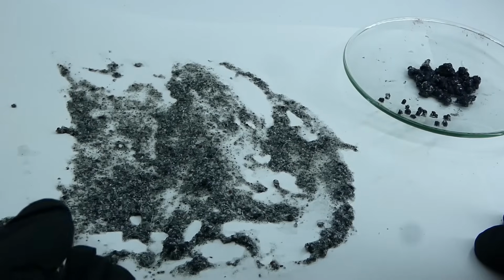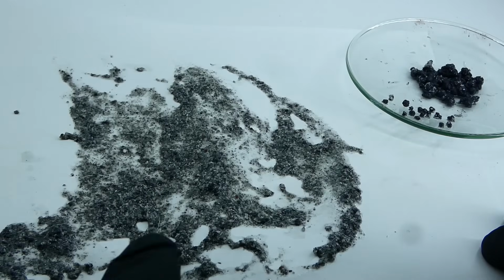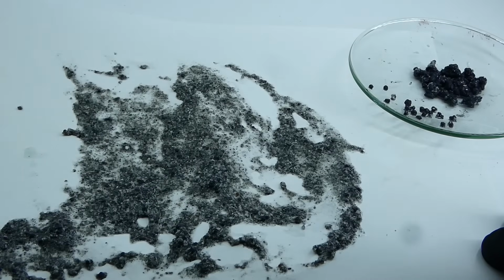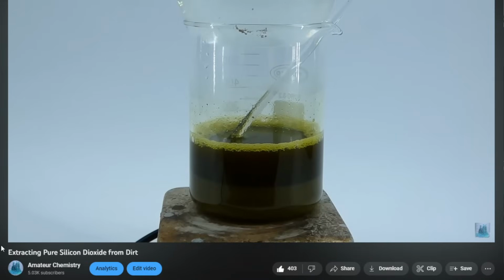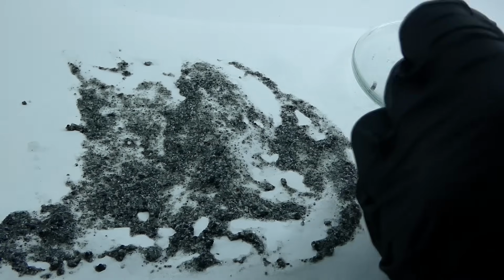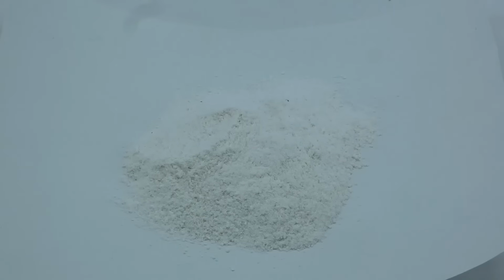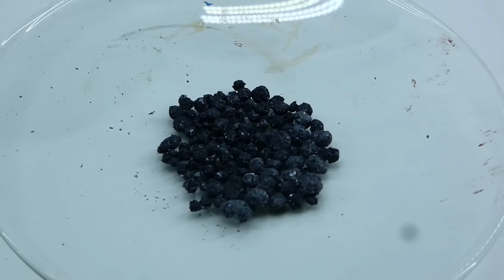So today's video is actually the second part of a series that I have been making for a while now, which is about making silane from dirt. In the first part I turned the dirt into some pure silicon dioxide, so if you haven't watched it yet, I recommend you check it out. In this video I will do the second step of this project, which is converting the silicon dioxide into pure silicon.